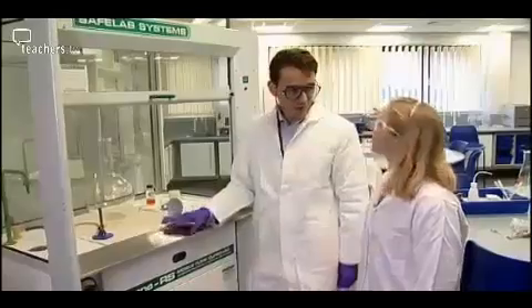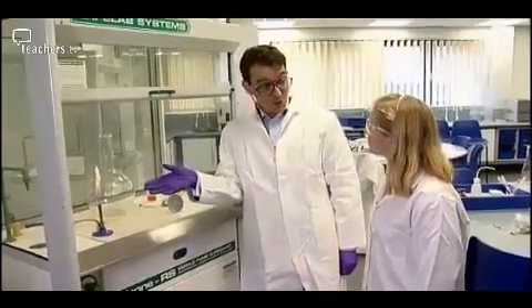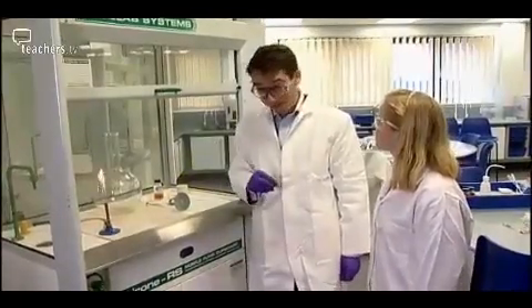So this is the catalytic oxidation of ammonia with chromic oxide flakes. It's a really nice reaction to show how ammonia can be oxidised with oxygen in the air. It's an exothermic reaction, but you need a catalyst to make it go.